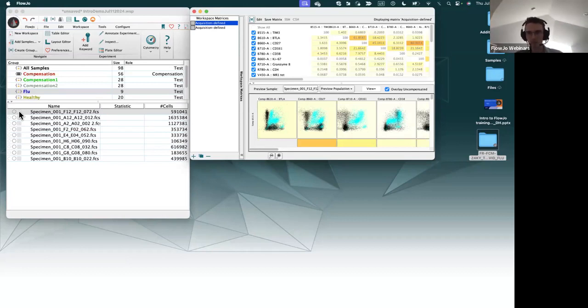Most cytometers do compensation. Usually the compensation done on the cytometer is pretty similar to what we would do in FlowJo. We have some additional options in FlowJo that might work better in some cases, but for a basic analysis, the compensation on the cytometer and the compensation of FlowJo will be similar, so we can just use the one on the cytometer. It should work great.